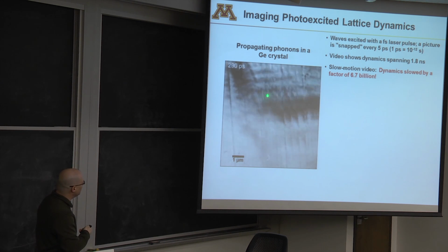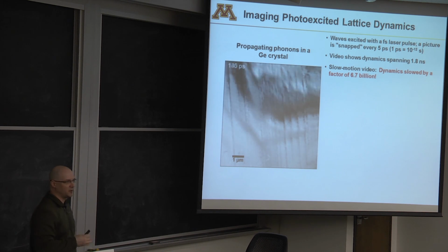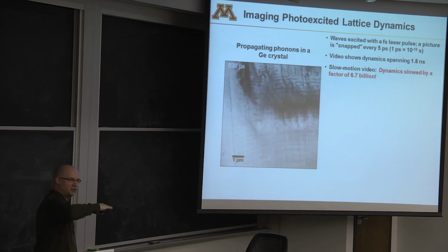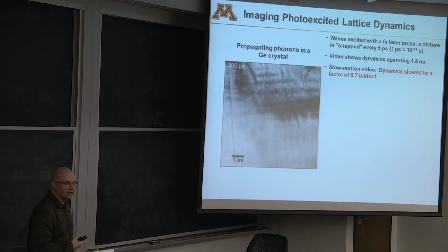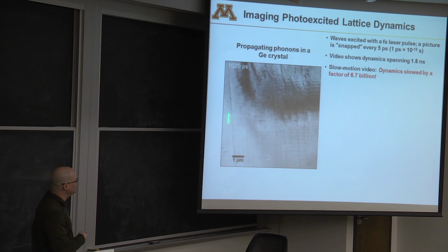So we hit it, boom, and all these waves start moving through this material. You can see they kind of follow along these lines. That's not by accident, we think. We don't know yet for sure. But we think that's on purpose. We're doing experiments now to see if we can guide these things through this material just by changing their positions, right? That would be a big deal, okay? And you can see all kinds of other wacky stuff goes on, right? There's weird shimmering. It looks like water shimmering and so on, right? This is absolutely amazing to be able to do this inside of a TEM, okay?